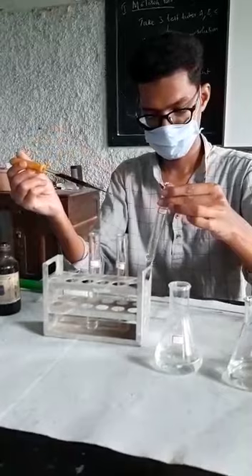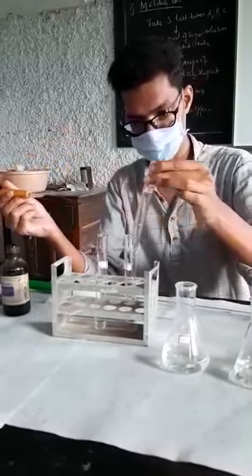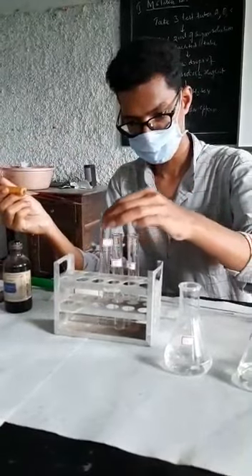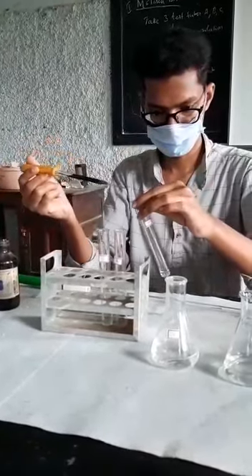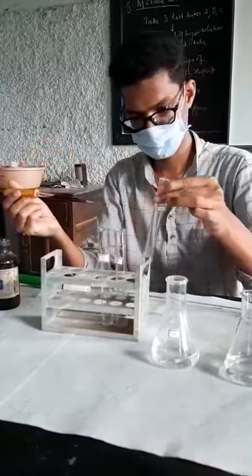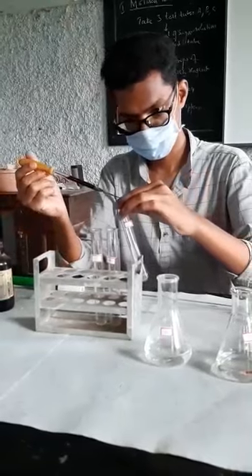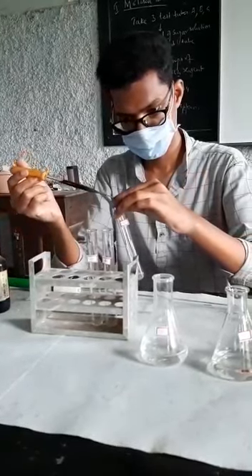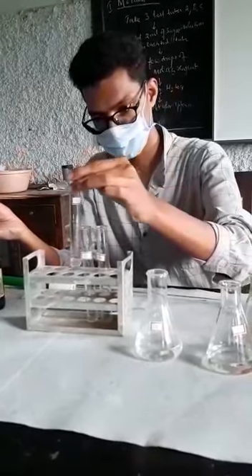In all, add the same amount. If you are adding 3 in all. Yeah. Three drops. Okay.